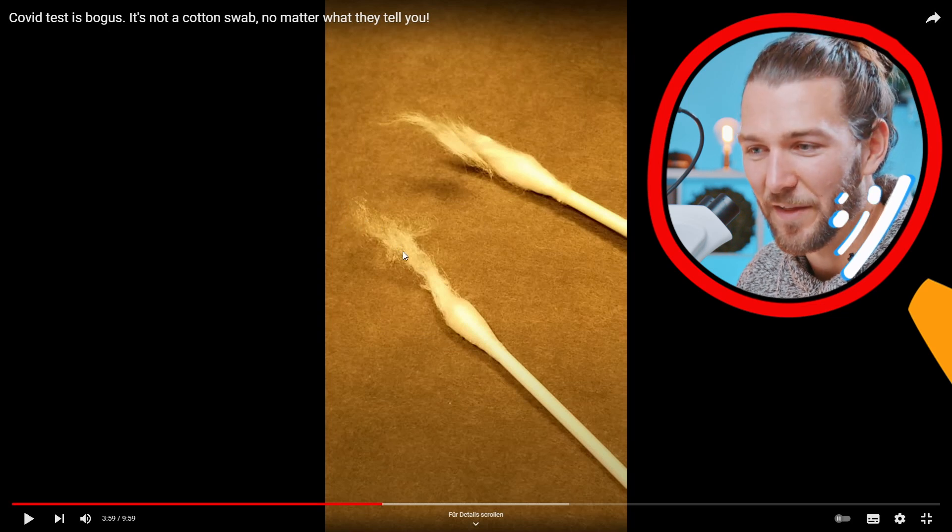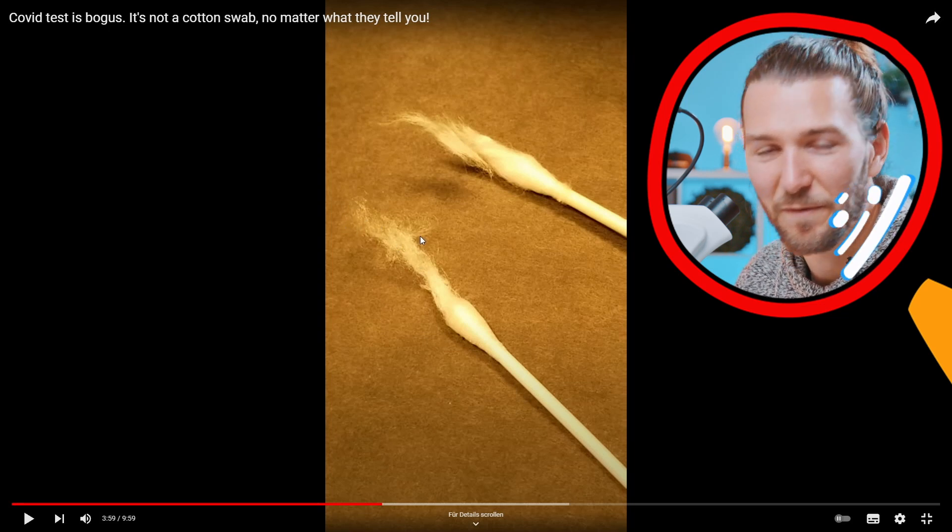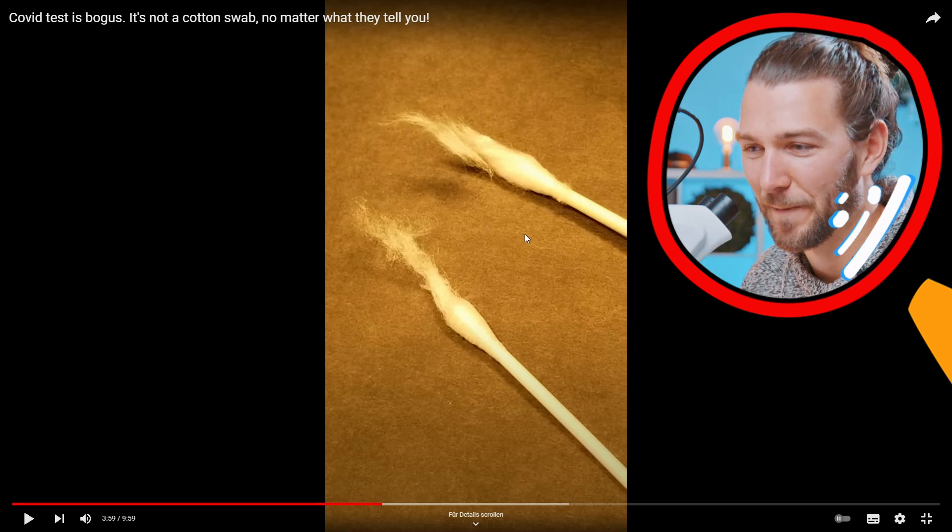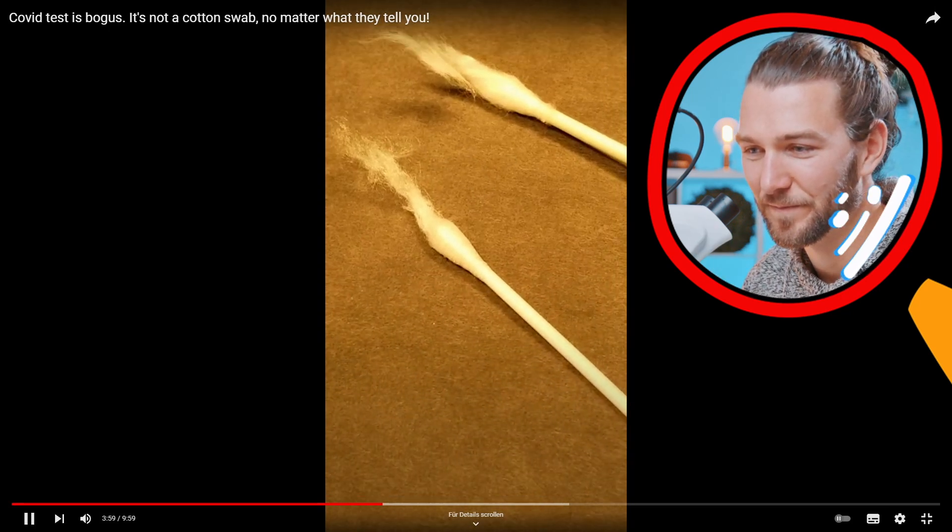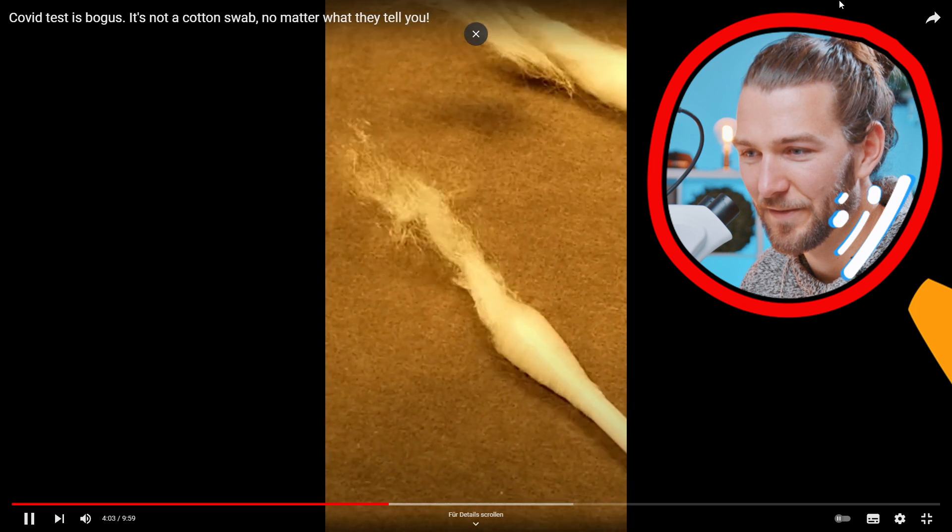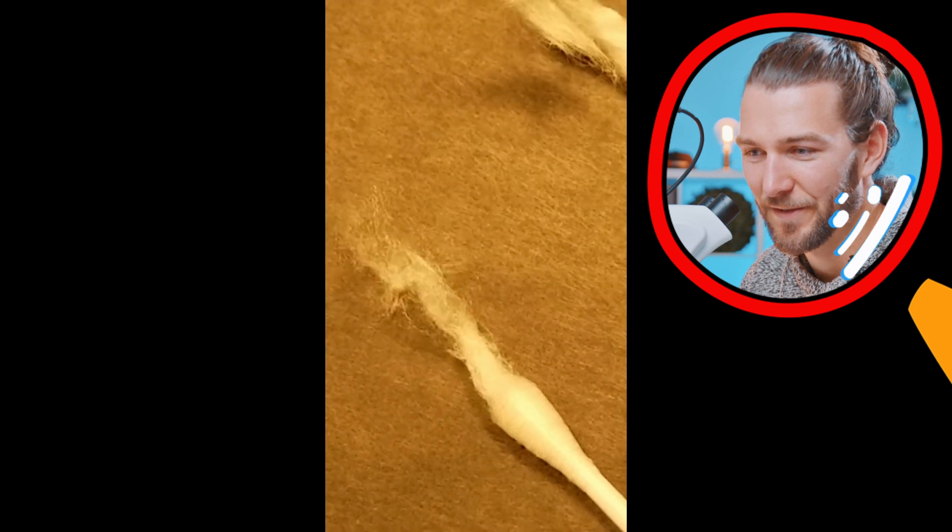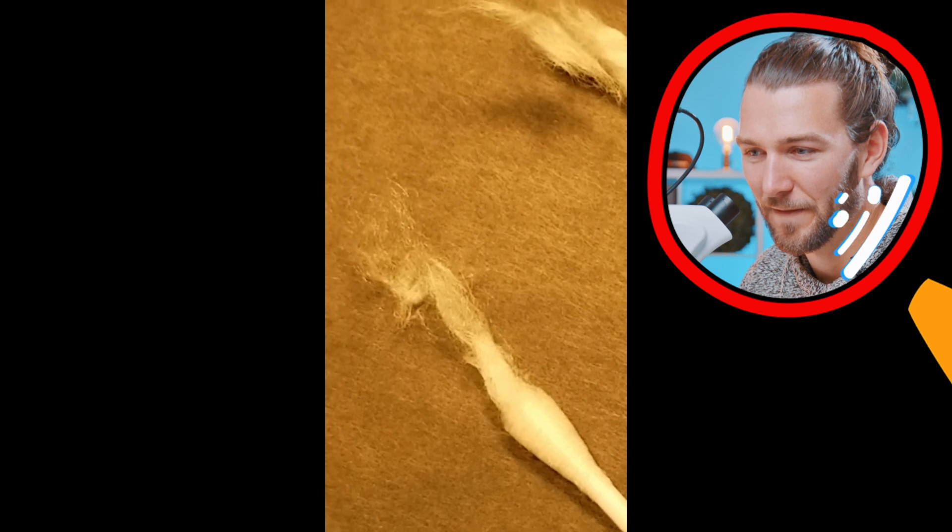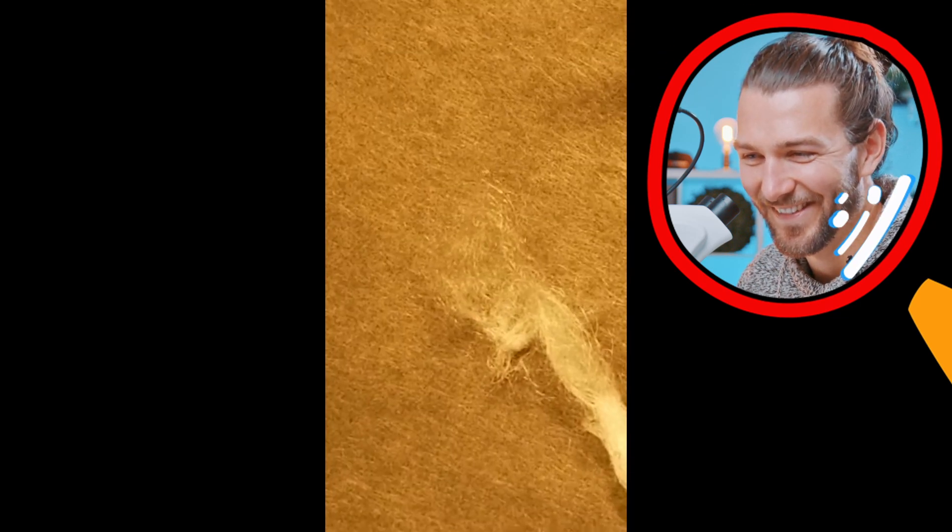And they argue now that these fibers are moving around, putting them side by side. First of all there's a lot of different, I can see the movement. I can literally see these things moving. There's movement going on.